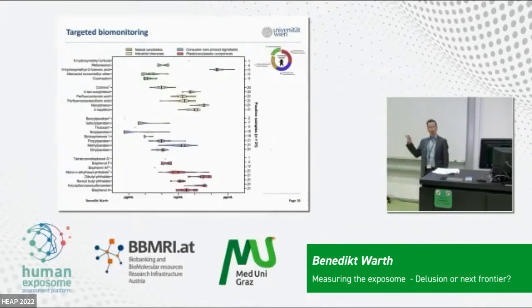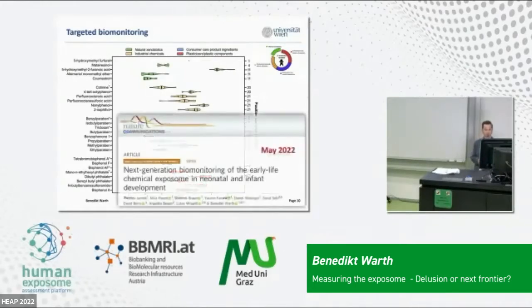And to look at it quantitatively, you see that this is another challenge in exposome research: we have to cover some chemicals that are very high abundant and others that are extremely low abundance, in the sub ppb and ppt range. And here we could cover already 6 orders of magnitude, and we are further working on that to get even more sensitive and have coverage of an even broader concentration range in the future.